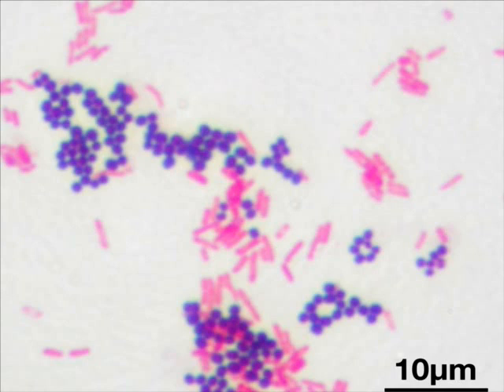What you see here, when you see a gram stain slide, you have to remember to comment on it under 3 headings: the shape, color, and the arrangement. Have you seen 2 types of organisms? Yes. One is violet in color, another is pink in color. So now you can say what are the violet color organisms? Gram positive are violet in color.